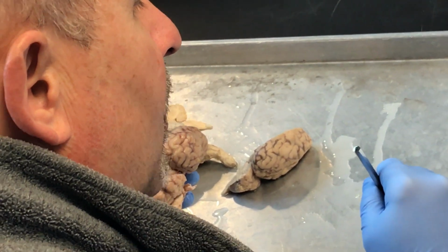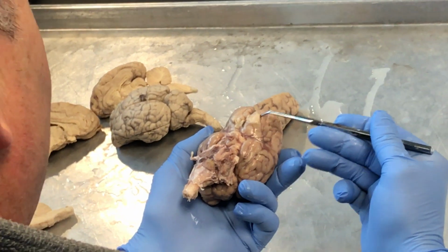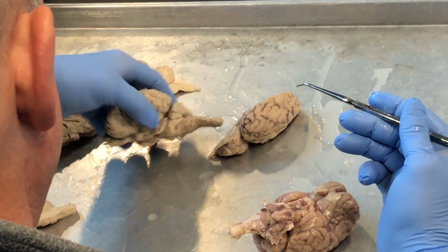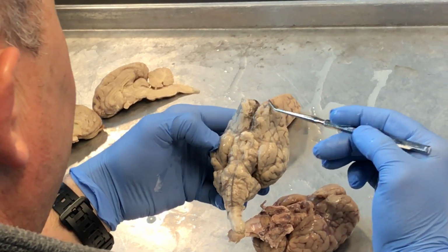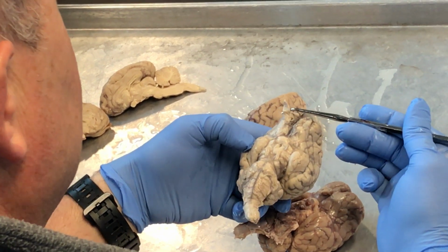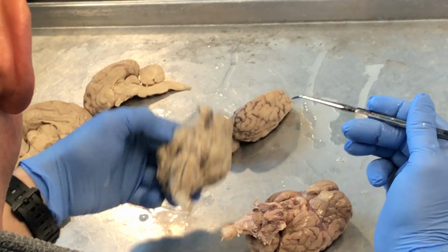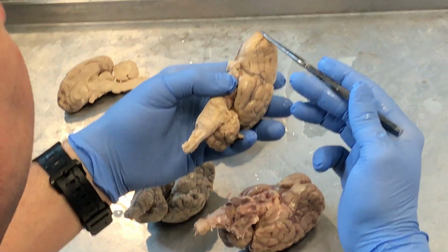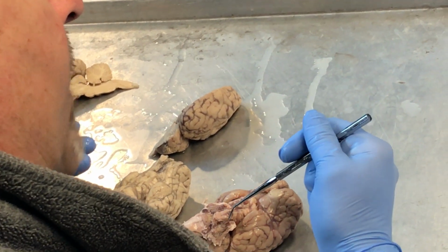Next thing, olfactory bulbs. Okay, so we fold this over here and you can see olfactory bulb there, and olfactory bulb's kind of been broken off there. Let's see if we can see it better on another sheep brain. This is probably a little bit better. No, it's cut off. This one's still intact. Olfactory bulb there, and then that one's broken off right there. See if we can see it on any of these. Sometimes they're there. Here's olfactory bulb right there. See it? Pretty straightforward.